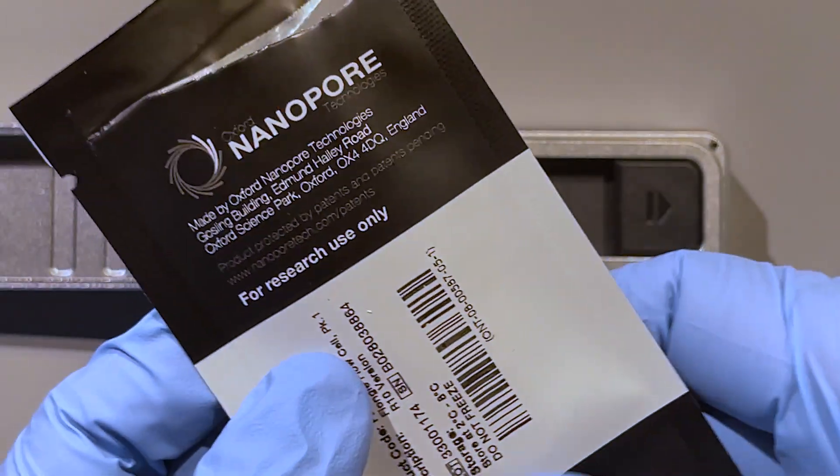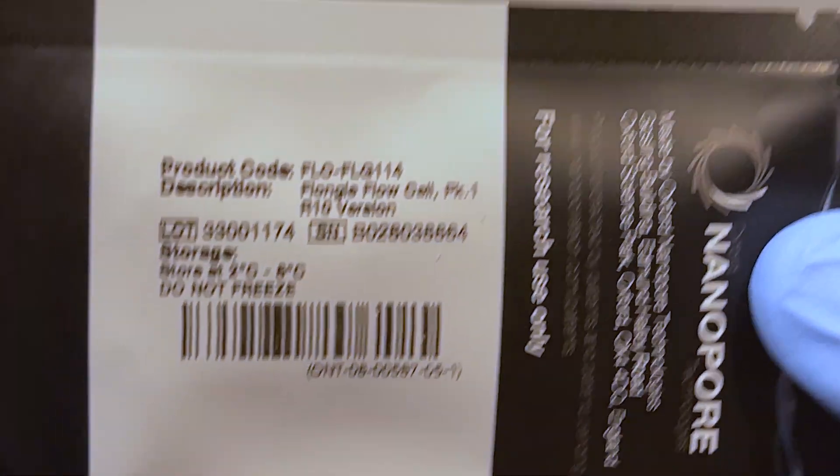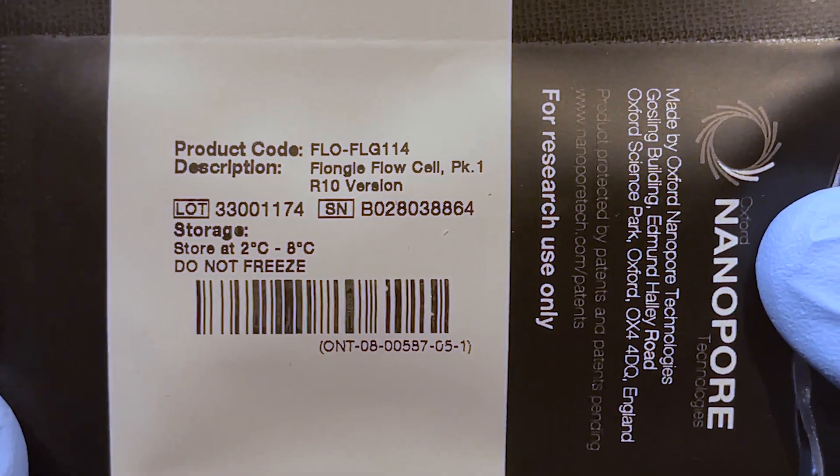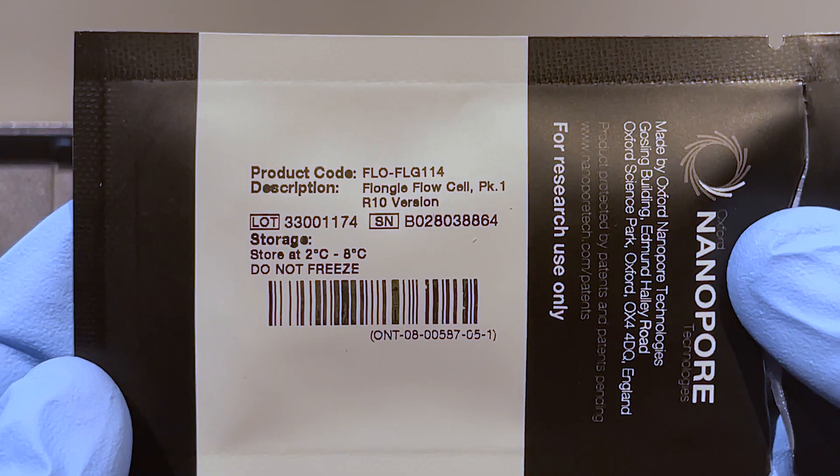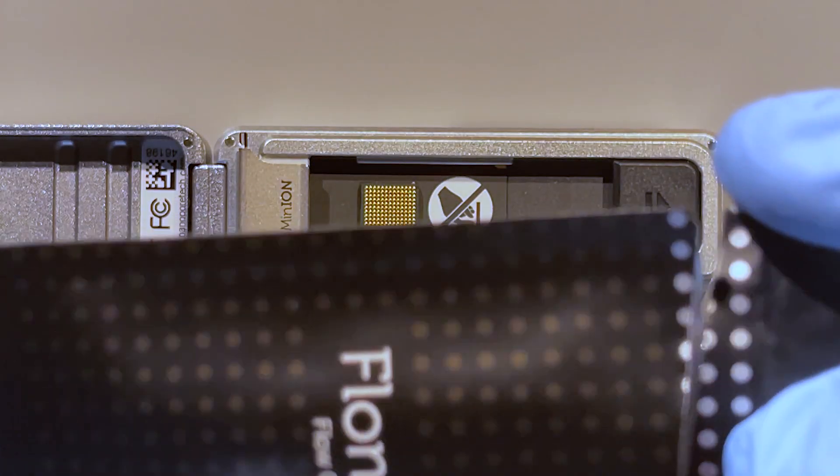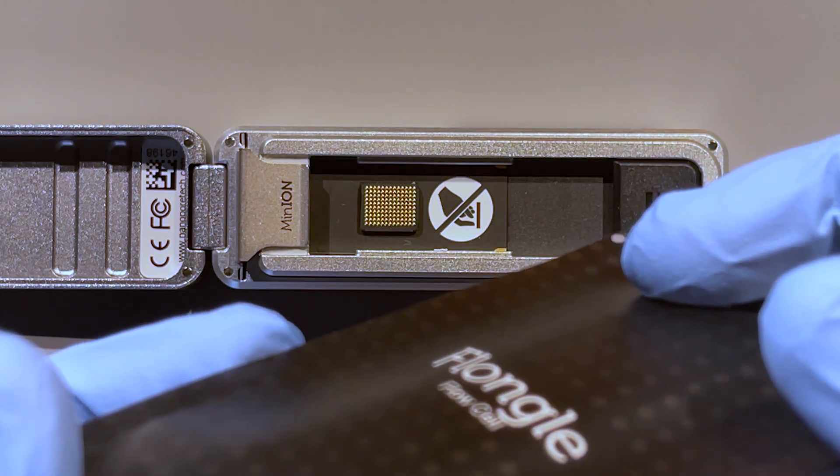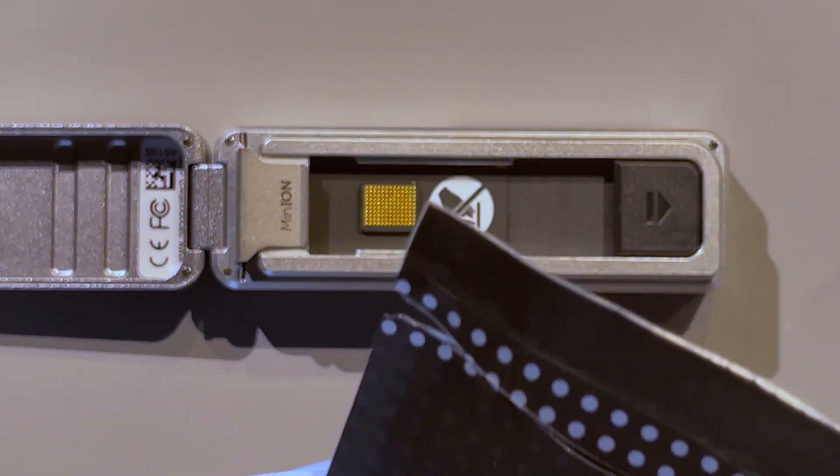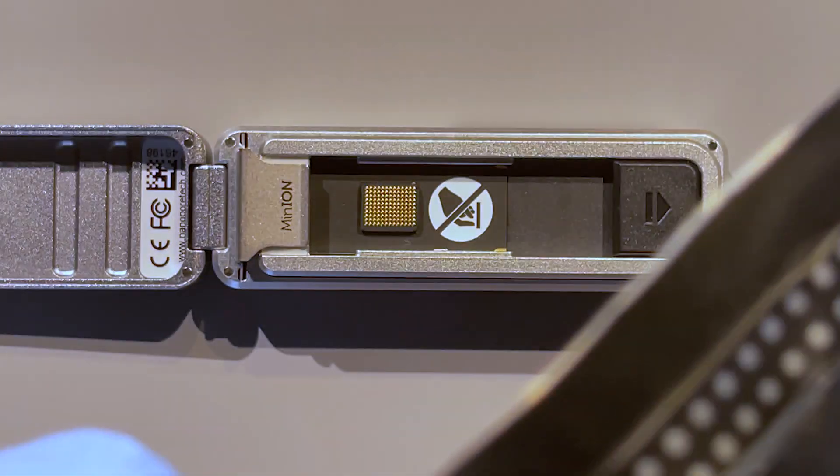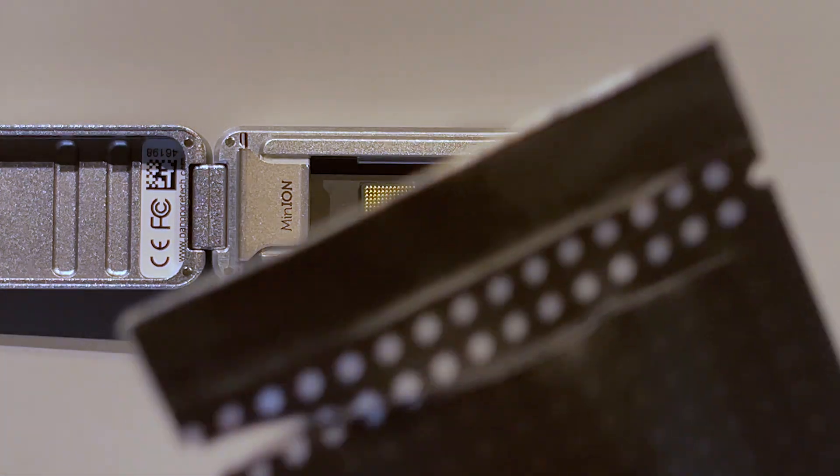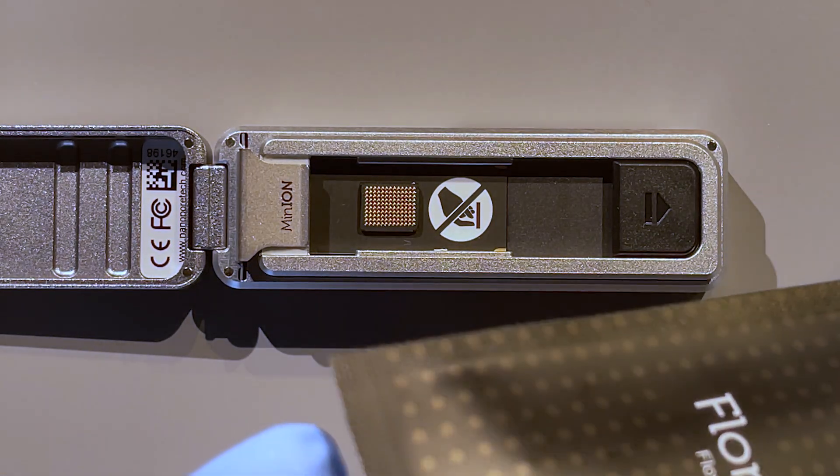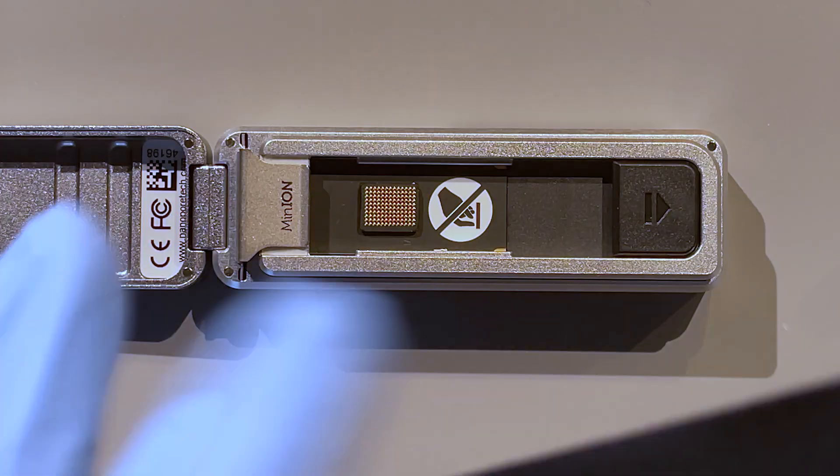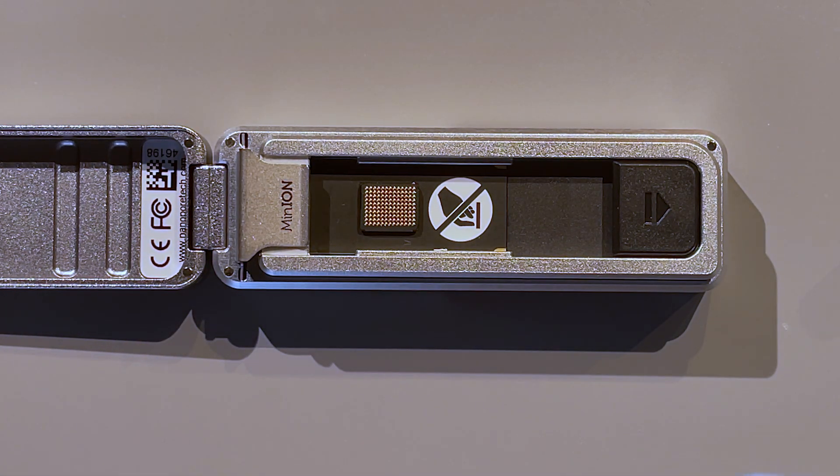So I push that in at an angle until I feel it go in, and then push down, and it's all nice and secure. So that is in there. I have a flow cell that I verified—what the product number is, the product code. I'll need that and made sure that everything matches with the kit that I'm using. You want to test the flow cells before you actually load them.